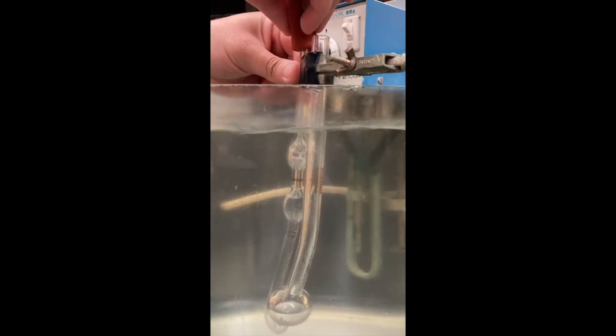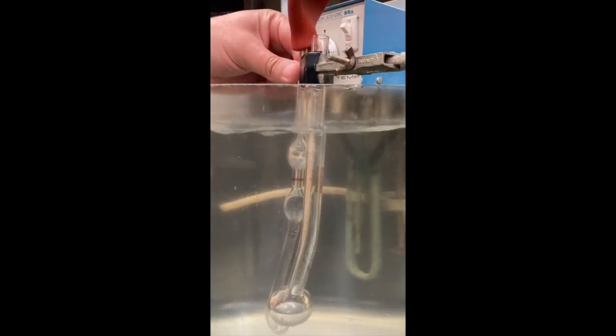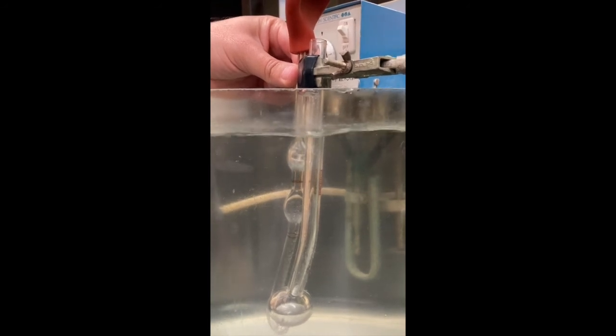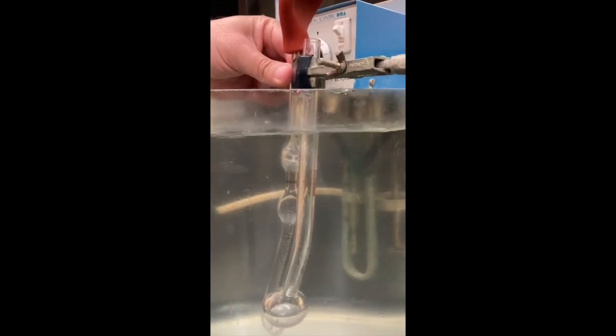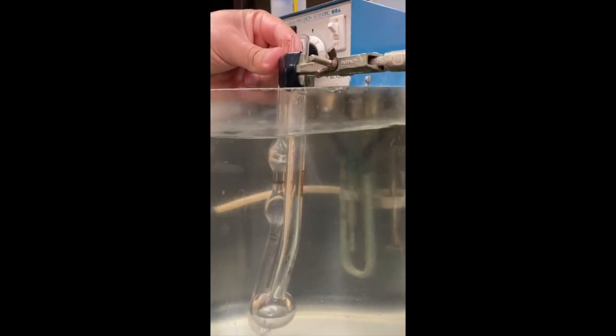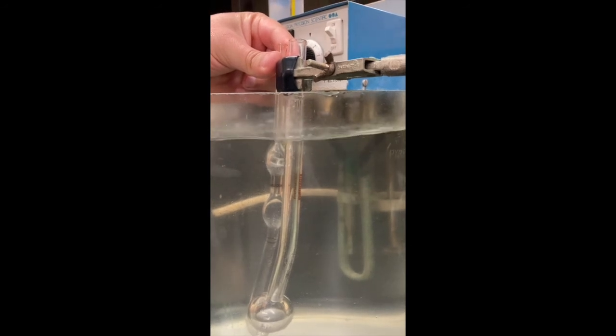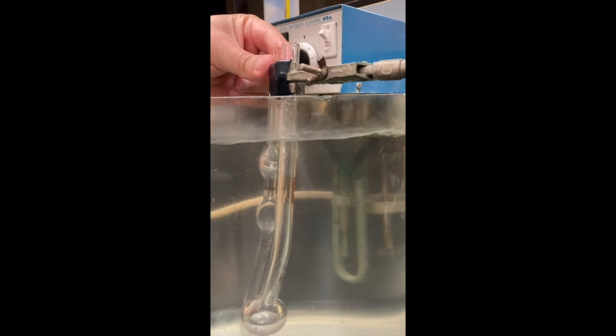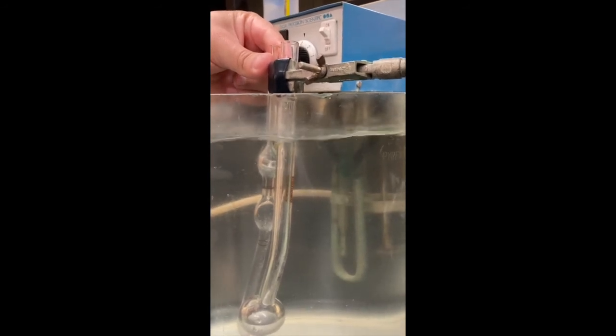You can see the level of water coming up. Alright, you can release it now. And now you wait to start our timer when the level of water goes through the upper division.